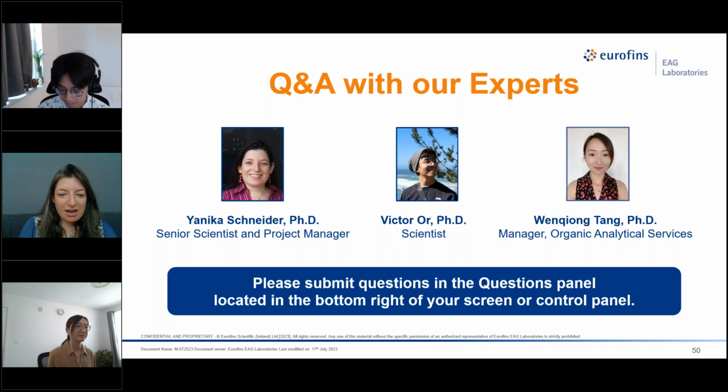It's a great answer. We have another interesting question, and it is asking if FTIR Raman can be used for polymer sequence determination. So I will answer that one, and that is going to be very challenging. It is possible. It depends on the polymer molecular weight, depends on a variety of issues. If the polymer sequences have different spectra, then yes, that's possible, but it's a challenging kind of analysis for vibrational spectroscopy. Perhaps pyrolysis GCMS might be better, or NMR or something like that.